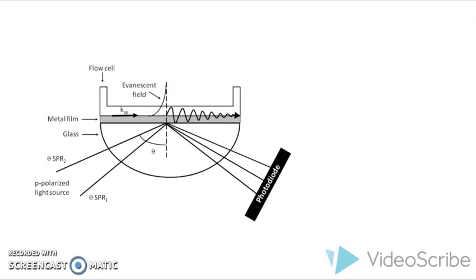In order to excite surface plasmons in a resonant manner, one can use electron bombardment or incident light beams. The incoming beam has to match its momentum to that of the plasmon. However, for a given frequency, a free space photon has less momentum than a surface plasmon polariton. However, coupling of photons into SPPs can be achieved using a coupling medium such as a prism, using total internal reflection. In total internal reflection, the reflected photons create an electric field on the opposite side of the interface. The plasmons also create a comparable field that extends into the medium on either side of the film.